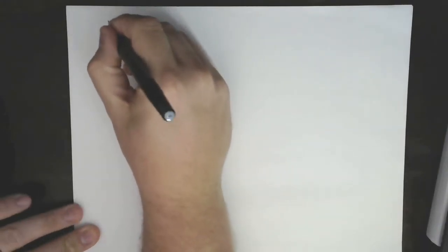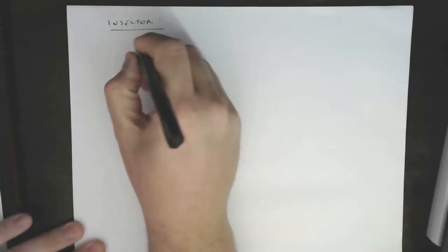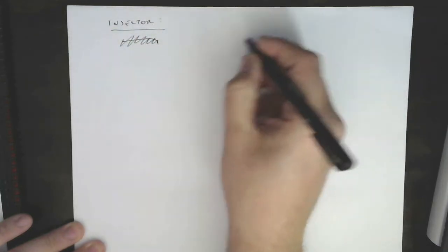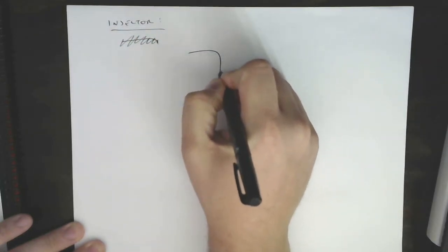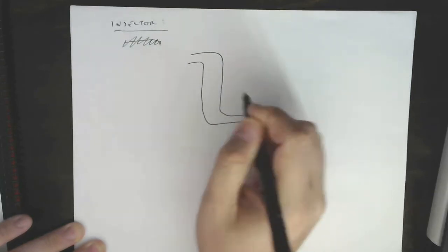Okay, a little bit more complex than an air fryer is the heated injector. So let's take a look at the injector in GC, and it is very different to the injector in LC. In LC, remember, we had the 6-port injector. In GC, we have a slightly different task, and that task is related to getting a very small volume of sample onto the column. So I'm going to try and sketch this thing out. It's a little bit complex, and so I'm sure I'm going to make some mistakes here. Actually, I've made my first mistake. I want a little bit of headroom. There we go. So picture a chamber with an inlet and an outlet.